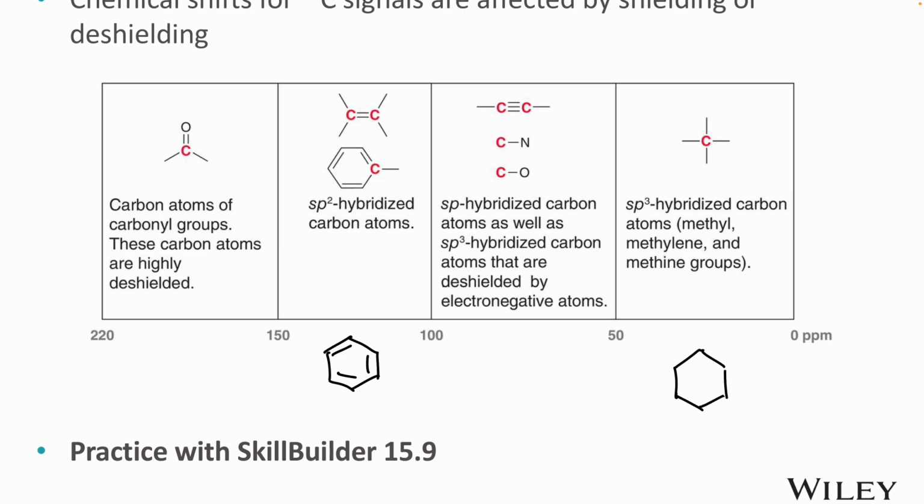How many peaks there are, again, is one of the most important pieces of information, telling you how many chemically distinct groups of carbons. Sometimes that alone is fine. You don't even have to pay attention to where they are on the spectrum. Just how many there are is a huge piece of information, all right? So anyways, I'm not saying this is worthless. It's definitely important, but don't solely focus on this portion right here, where it's expected to be absorbed.